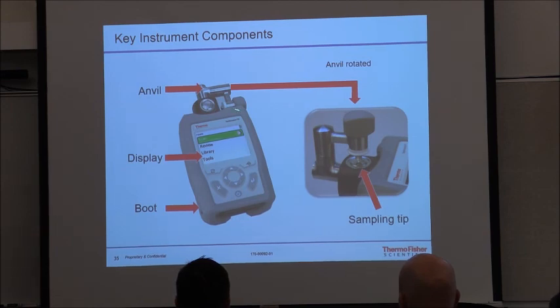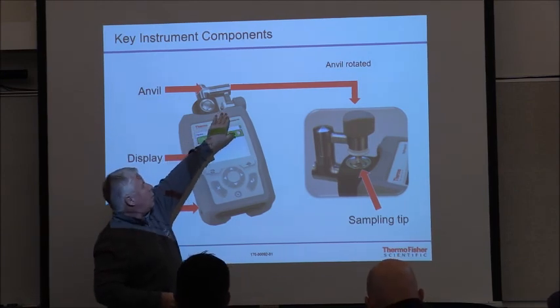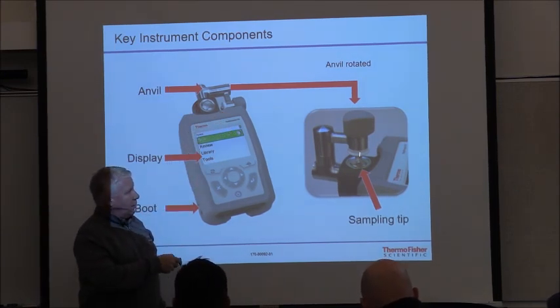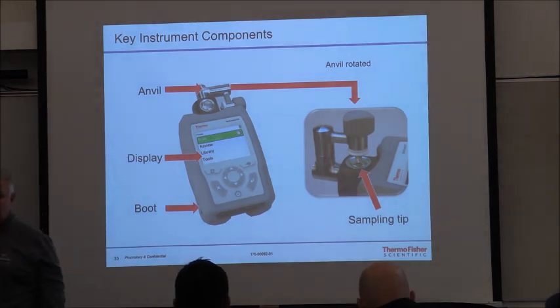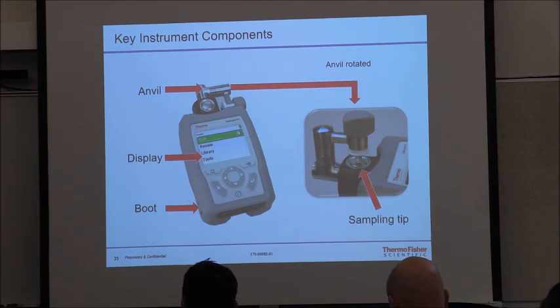Now, in the FTX, where you've got the diamond up there, you've also got this anvil. This is manually operated. The Gemini will automatically move the anvil up and down after you swing it into place, but it will be motorized, okay? On the FTX, you've got a sampling knob. So what you do here is rotate it up, and then you use the knob to manually lower the anvil onto the diamond tip. You will lower it and you will hear it click. Once you hear it click one or two times, stop. Okay. If you clicked it 10 times or 12 times, you're not going to build any more pressure.